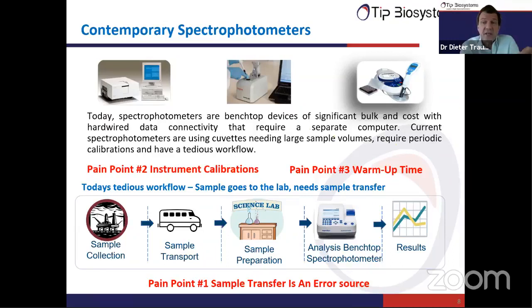Then if this intensity changes, that will cause an error.